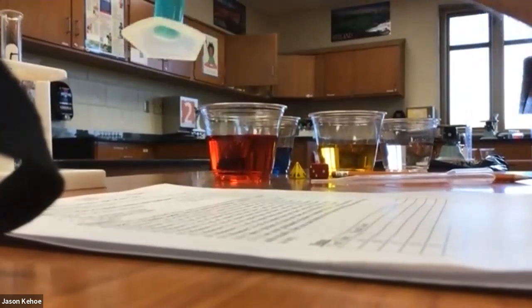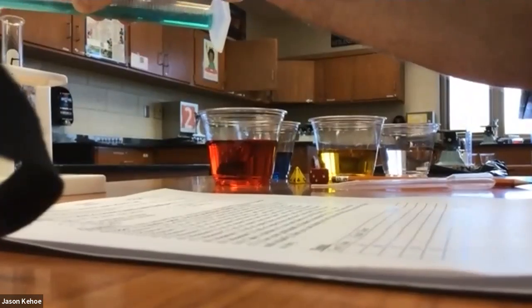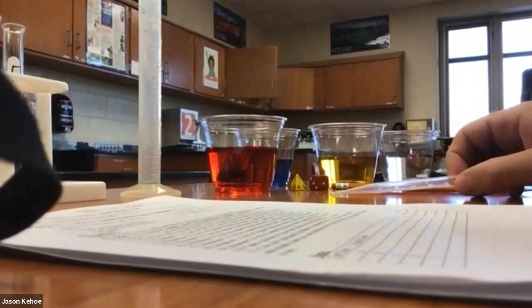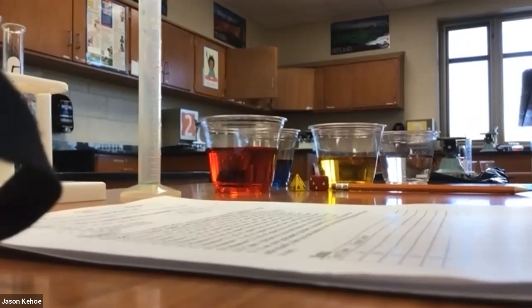And as you can see, it turned a little green. There was a little leftover. I'm trying to make this video short, so I'm skipping steps like rinsing things out. That should be okay. And now we're going to be moving smaller amounts of water from one test tube to another.